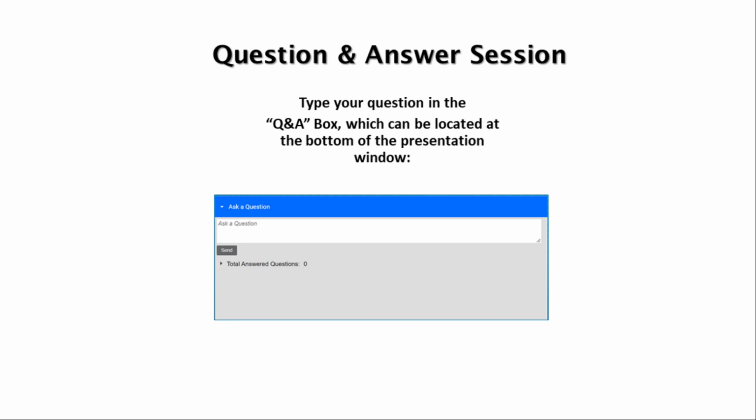Great. Thank you for that explanation there. This might be our last question of the day. Are there any issues with upgrading to a UHPLC system and still being in compliance with these modernization allowances? No, I would say there really wouldn't be any issues as long as you're following the USP guidance and not changing anything drastic like stationary phase.